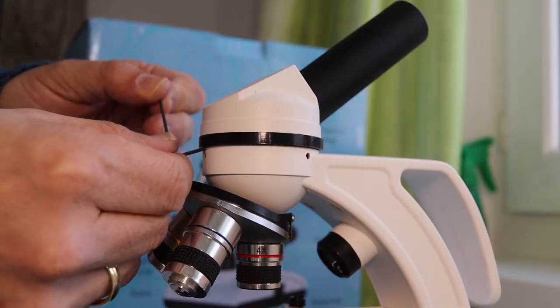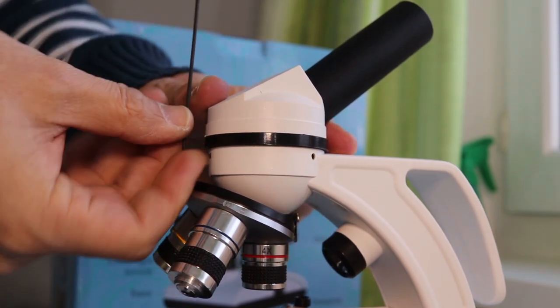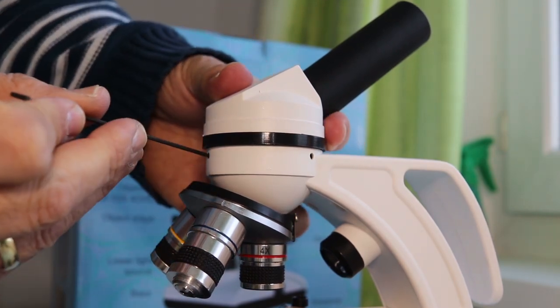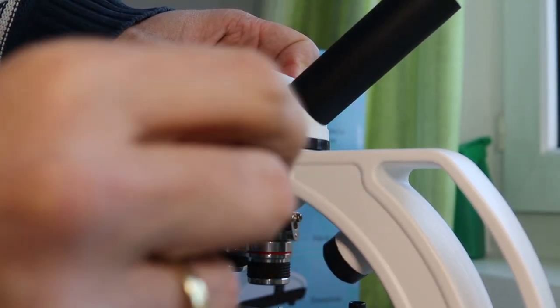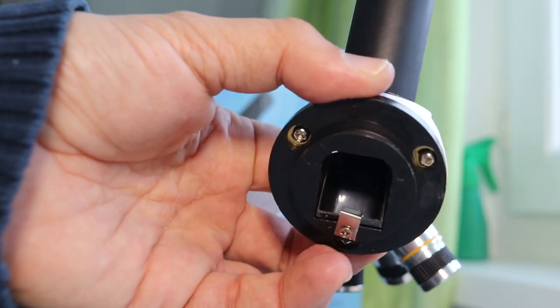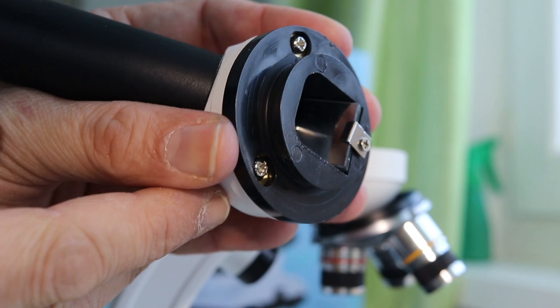So now let's disconnect the tube of the microscope. I need separate tools for this, and these tools were not provided. I'm simply unscrewing them, and now let's have a look how it looks in there. What we see is a small mirror which redirects the light. Normally there should be a prism in there. I'm not saying there should be, but for cost reasons they have simply used a mirror.